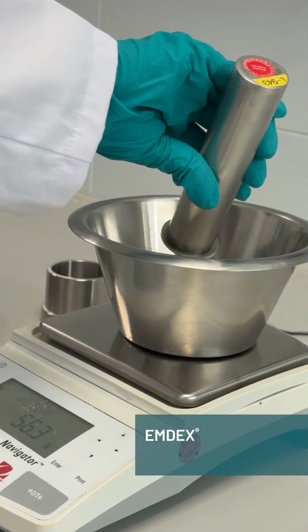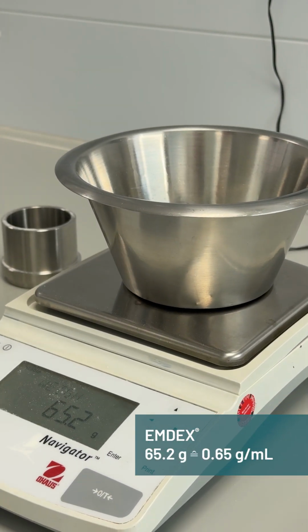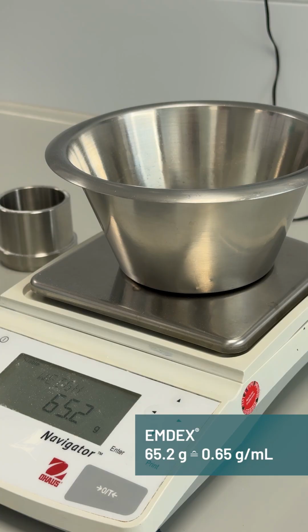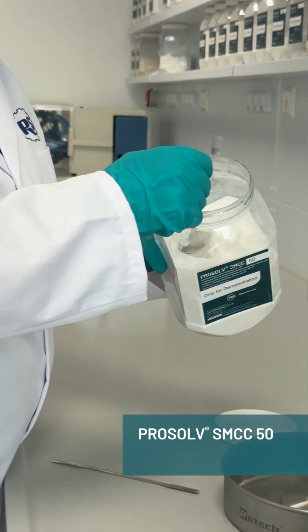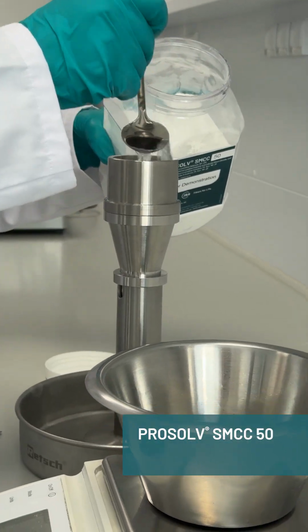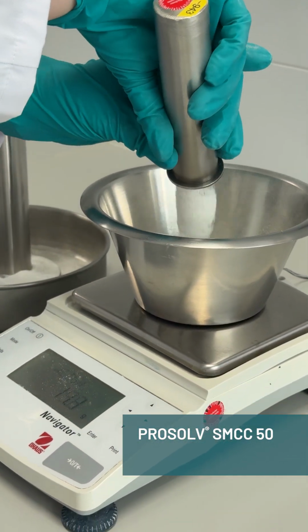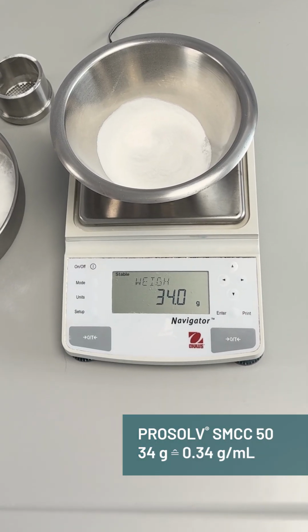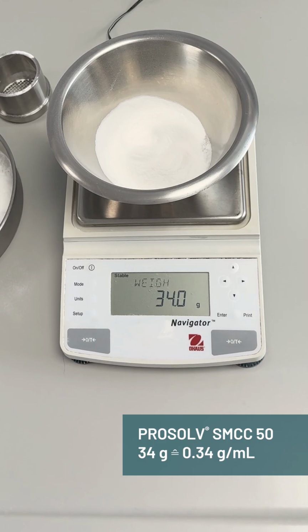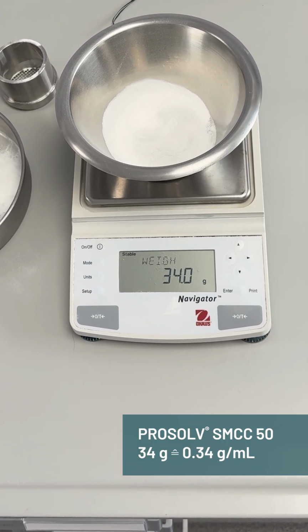Now I'm going to weigh how much this cylinder holds. It held 65.2 grams to give a bulk density of 0.65 grams per milliliter. Once again, I'm going to fill it up and weigh how much powder is in here. Here you can see it's only 34 grams of material in that same 100 mils, so a bulk density of 0.34 grams per mil.